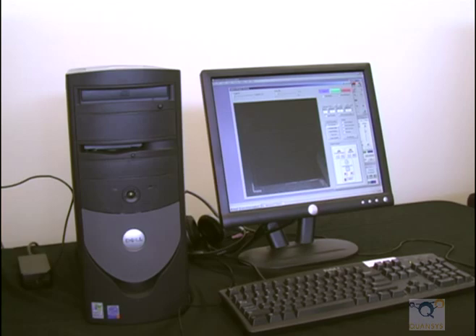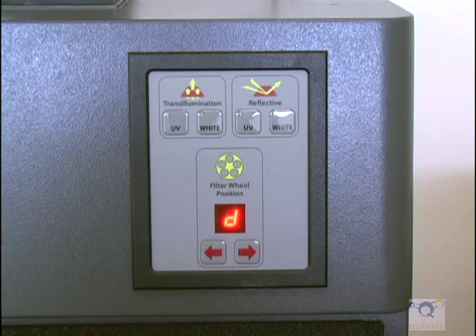Close all doors on the camera and ensure there are no light leaks. Make sure there are no lights turned on in the cabinet and that the filter wheel is set to 1.